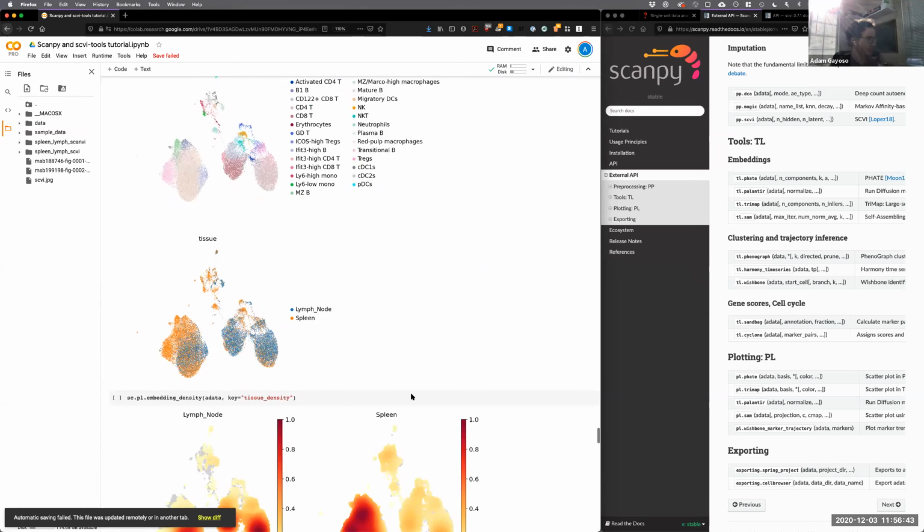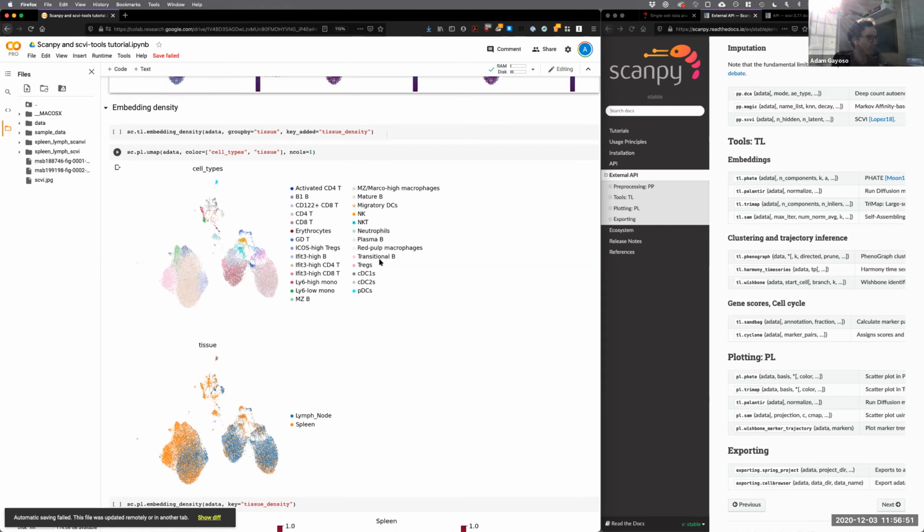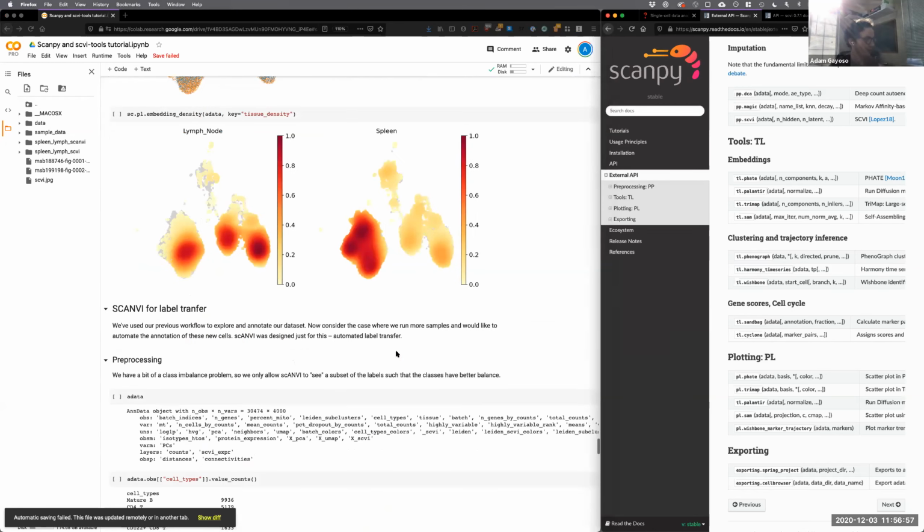Okay, this is actually as far as I thought I was going to get, but Scanpy has all the, like, their documentation is very, very good. And I think once you get a feel for the AnnData and sort of the workflow, it's easy to start plugging your AnnData into a lot of these functions.